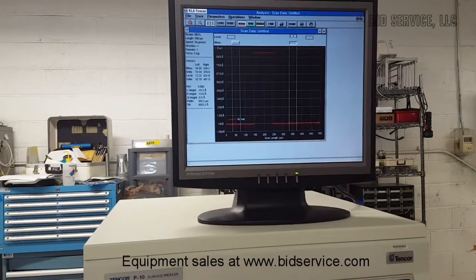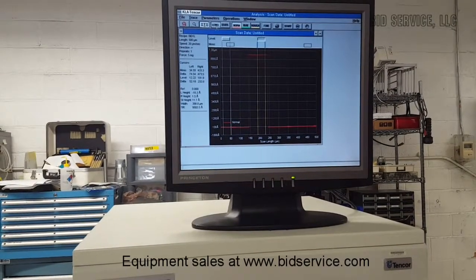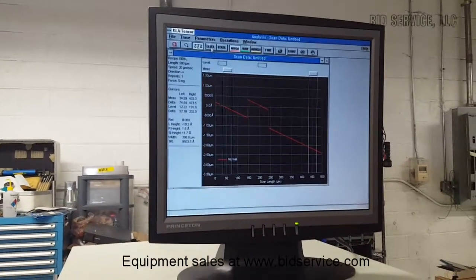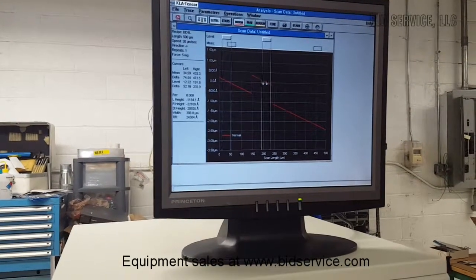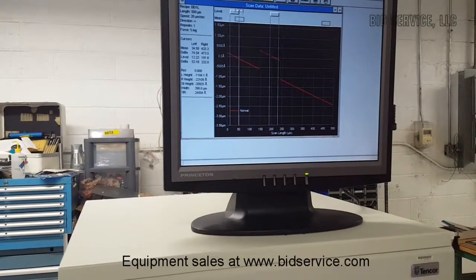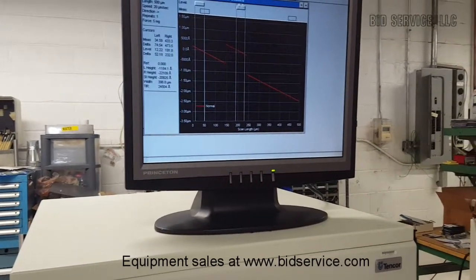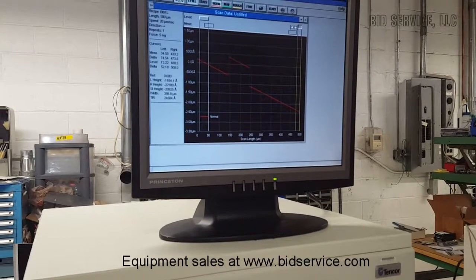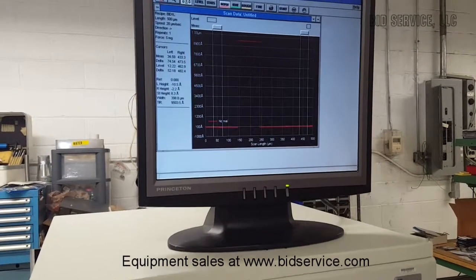I'm going to show what happens if the leveling is not proper. See, right now I selected the wrong zone. I have placed the level cursor on the step here, so it resulted in a tilted scan. If a scan appears like that, then you have to enable level, move the cursors on either side of the step, and press the level button, and it will be leveled again.